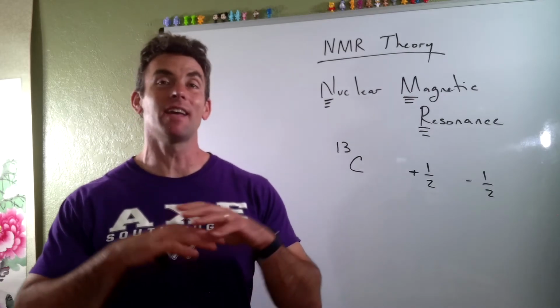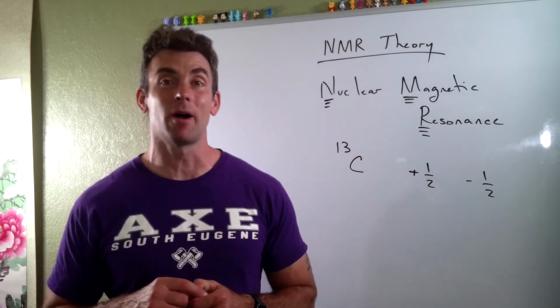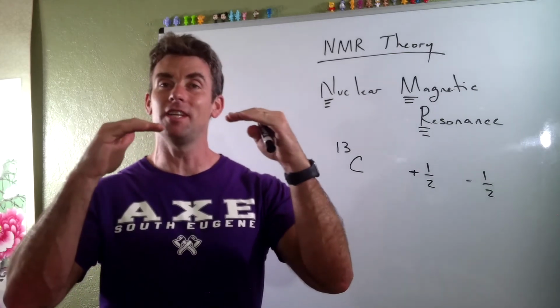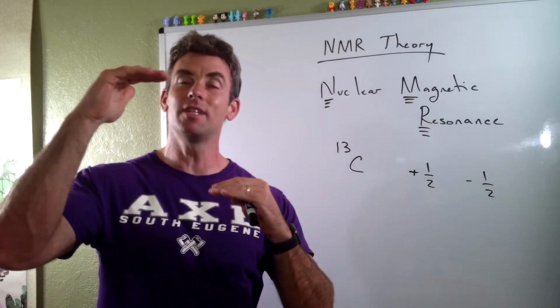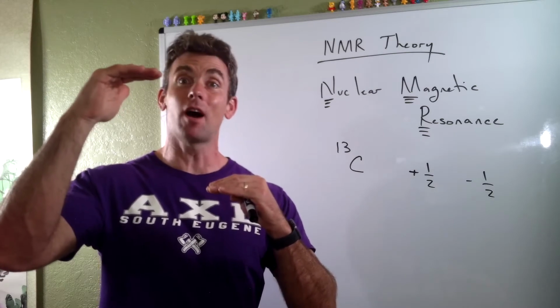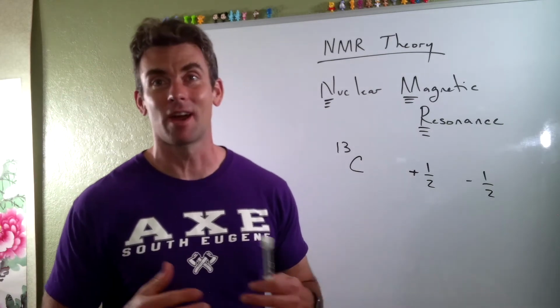It's this gigantic superconducting magnet that's really, really strong. And it turns out, for some reason of physics we don't care about, those two spin states are said to be no longer degenerate. In other words, one spin state, let's say spin minus 1/2, tends to go down in potential energy, and the spin of plus 1/2 goes up in potential energy. And by the way, the plus 1/2 and minus 1/2, even those are kind of arbitrary.